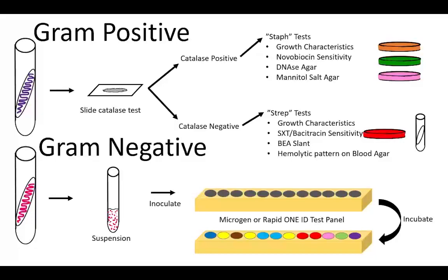Those that don't are very peculiar, and so they're easy to identify based off of that. They're mostly Streptococcus species. The most important aspect, though, is that catalase is such a reactive enzyme that even catalase on your skin, produced exogenously, will alter the results. You can get a catalase positive test with a very minimal amount of contamination because the enzyme is so active, the fastest enzyme known to man, so be careful with that.